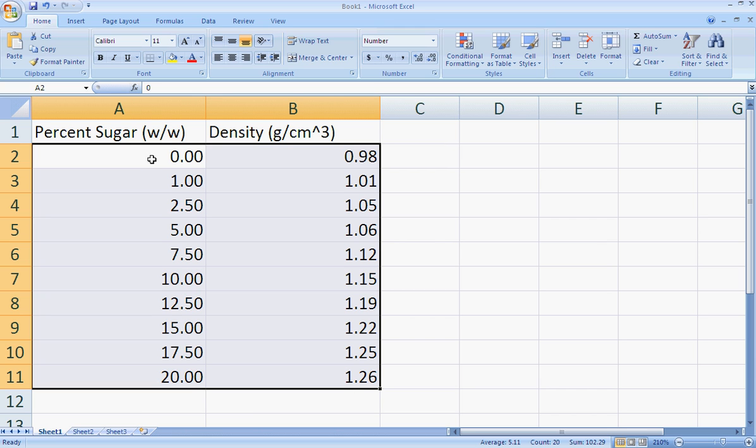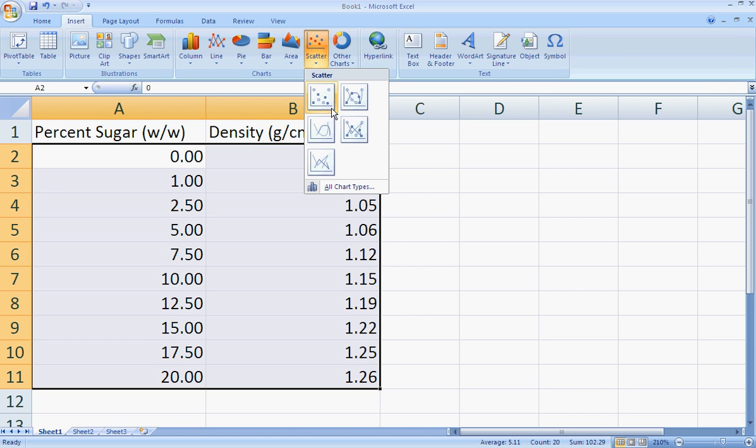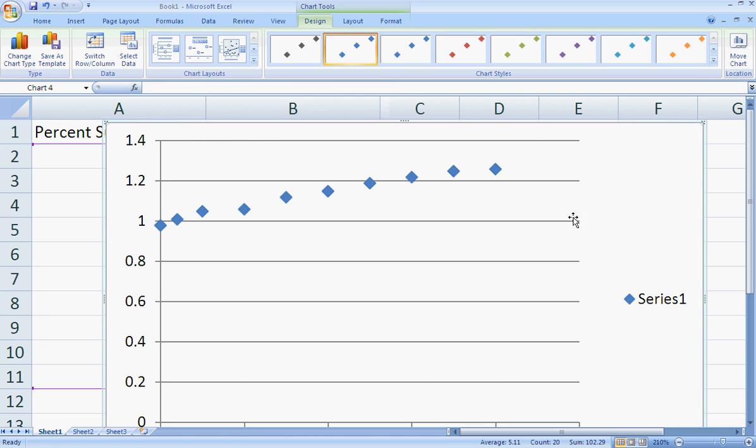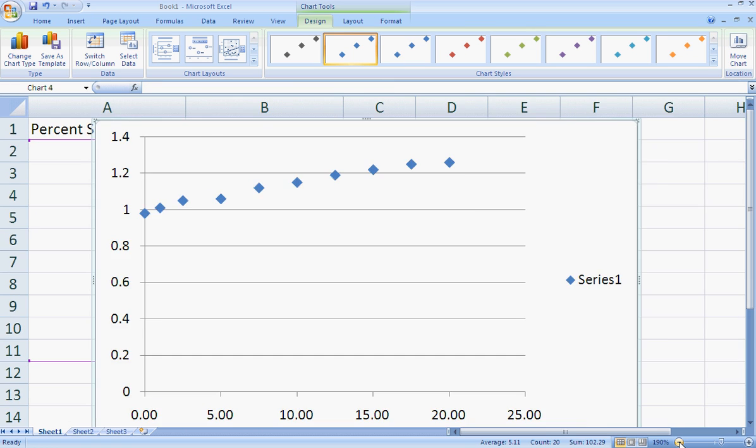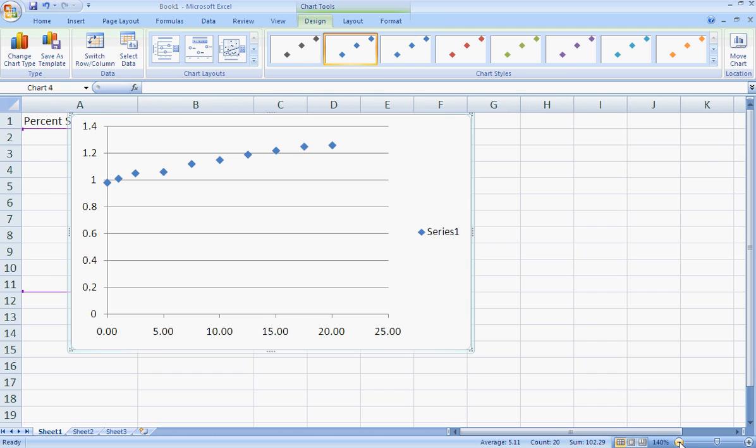So I set it up like this and I will come up to Insert on the top, Scatter, and click the Scatter button. All right, I had zoomed in here so I'm going to zoom out a little bit.